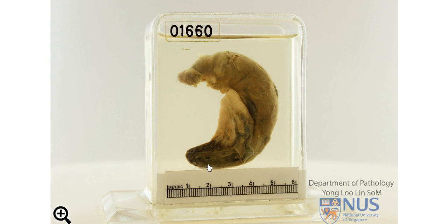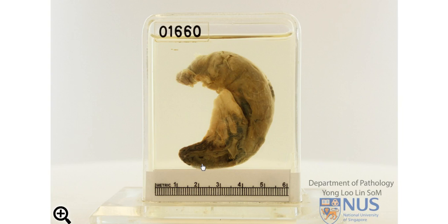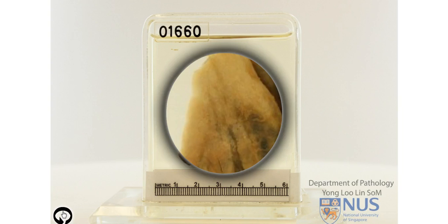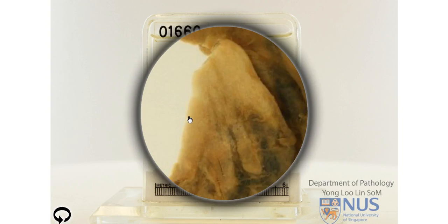Now looking at the tip of the appendix, we can appreciate that the colour is rather dark in the wall of the appendix, and this is due to congestion and hemorrhage.